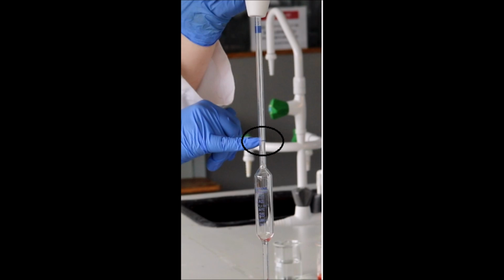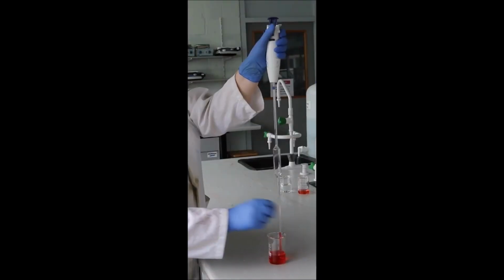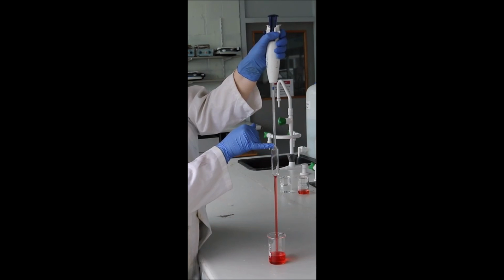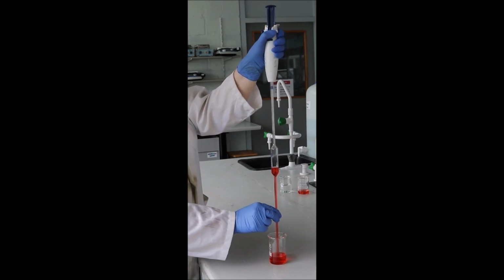I've paused the video here just for a moment to remind you where the calibration mark is that you should be filling the pipette to. Notice here how I gently rotate the wheel with my thumb to draw the liquid into the pipette. I make sure the tip of my pipette is always below the surface of my solution to ensure no air is drawn up into the pipette.